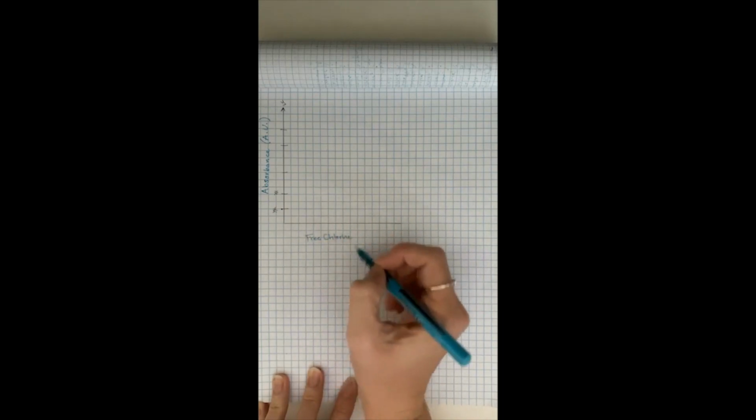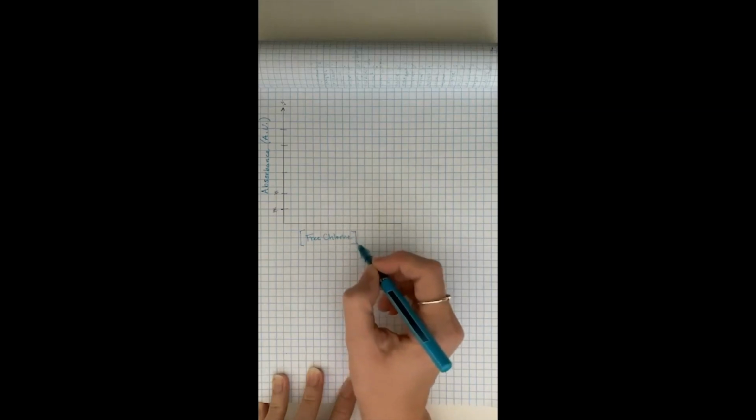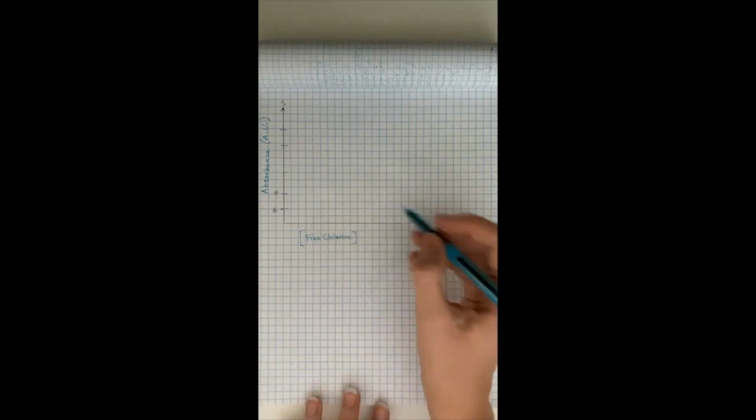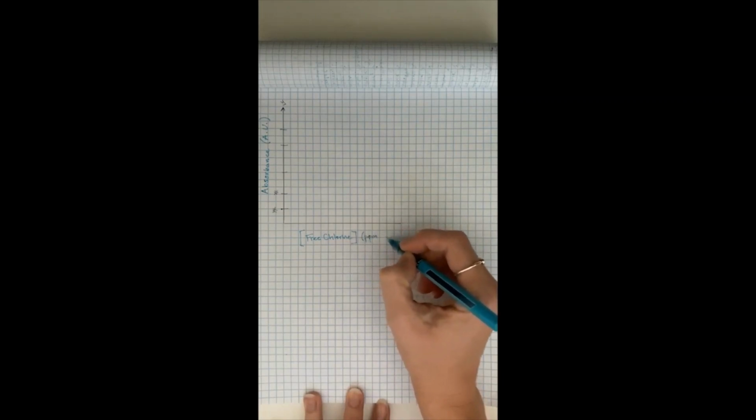You can write free chlorine concentration. I'm going to put these marks around it because that is another way to signify that it's the concentration of something. And we're going to measure this in ppm or milligrams per liter, whichever you prefer. Just make sure you're consistent.